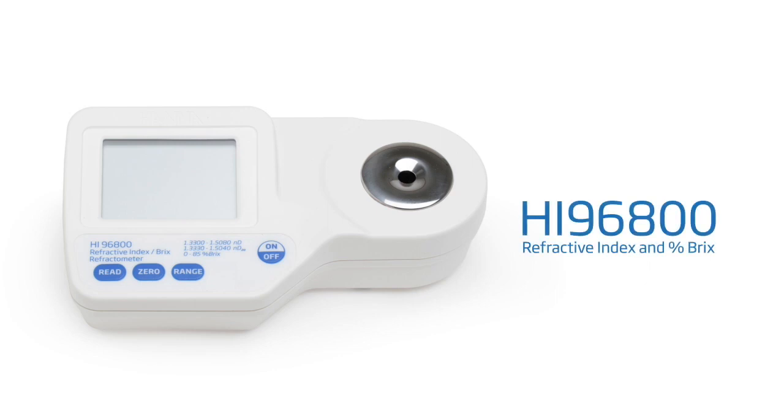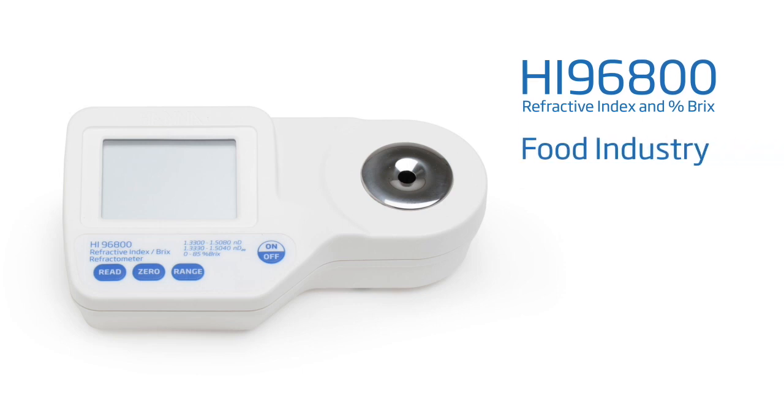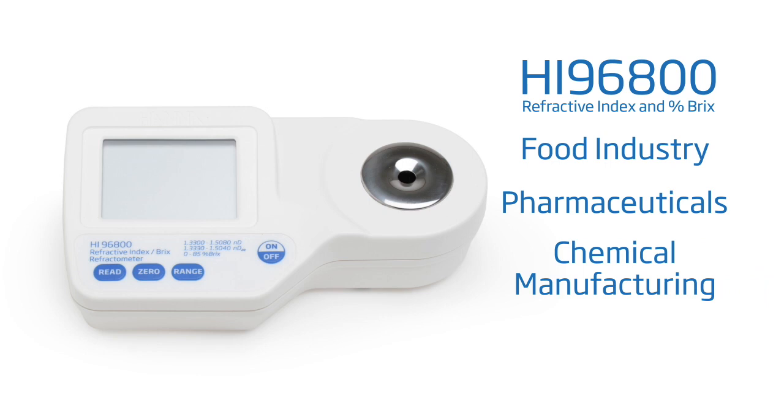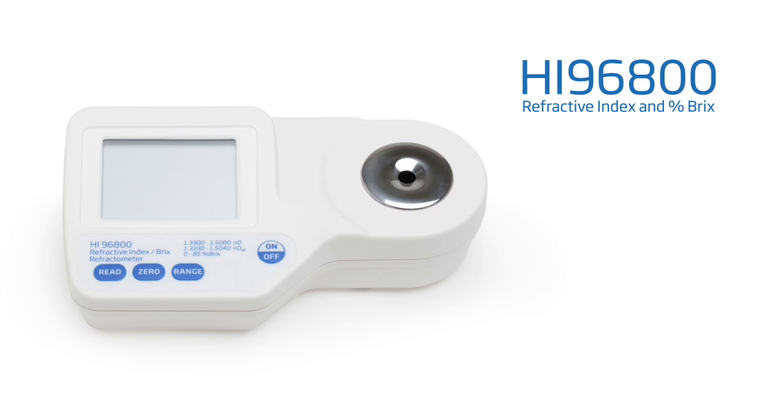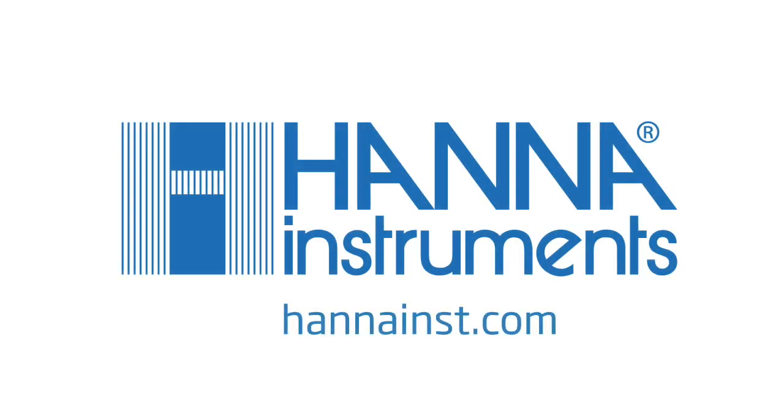Hanna's HI-96800 digital refractometer offers customers the ability to measure refractive index for a variety of samples found in the food industry, pharmaceuticals, chemical manufacturing, and many more. This meter offers high accuracy and durability, making it a great choice for field or laboratory use. For more information about this or any of our other products, please visit our website.